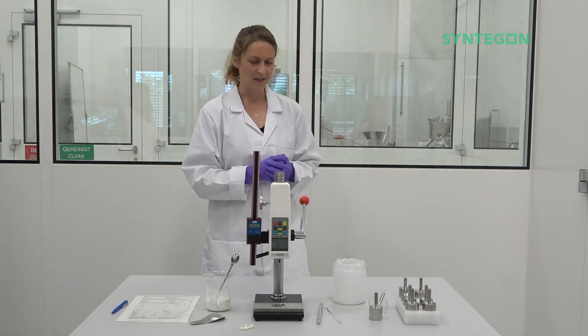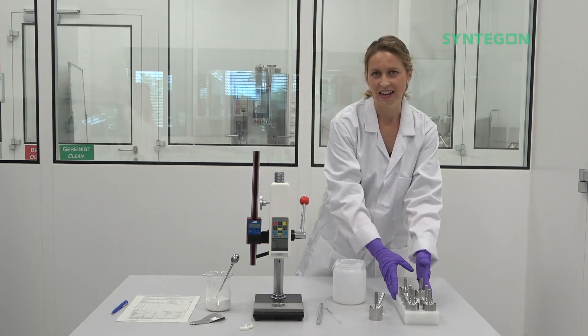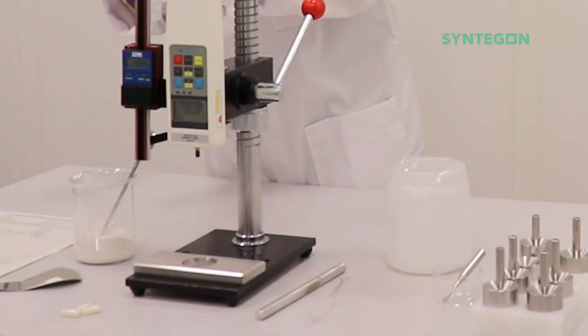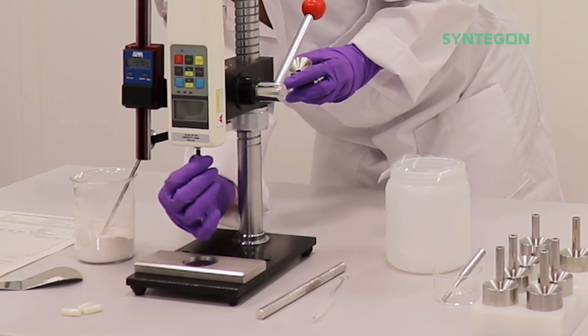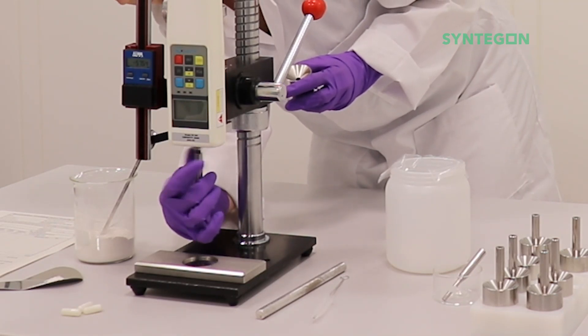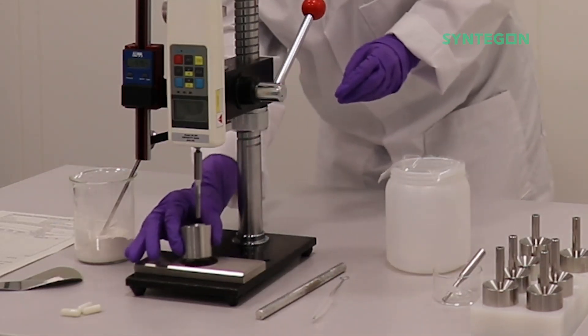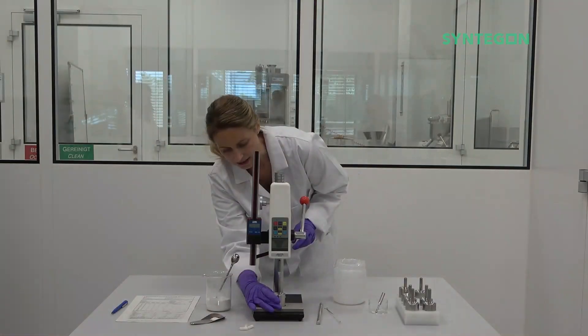So what do you need? Together with the tamping test device you will get a set of dies and pins. We will use for this test capsule size zero. Just mount it to the device — you have the pin outside and you have the die on the down side.